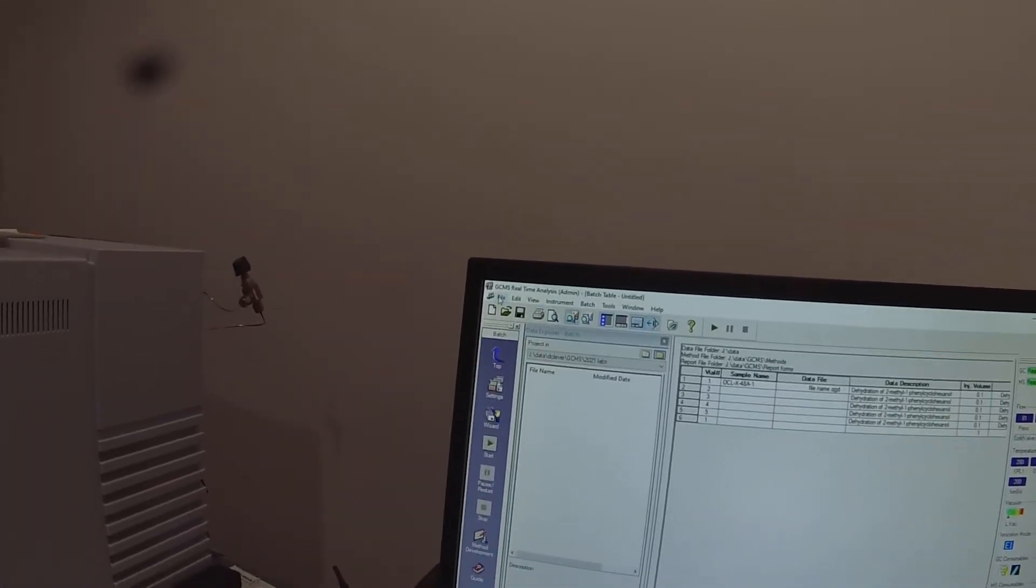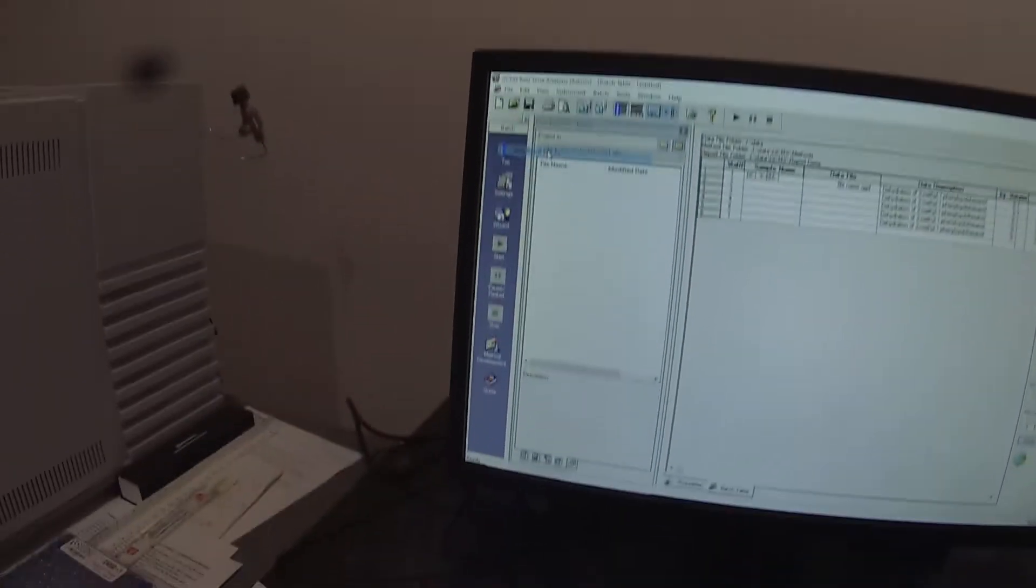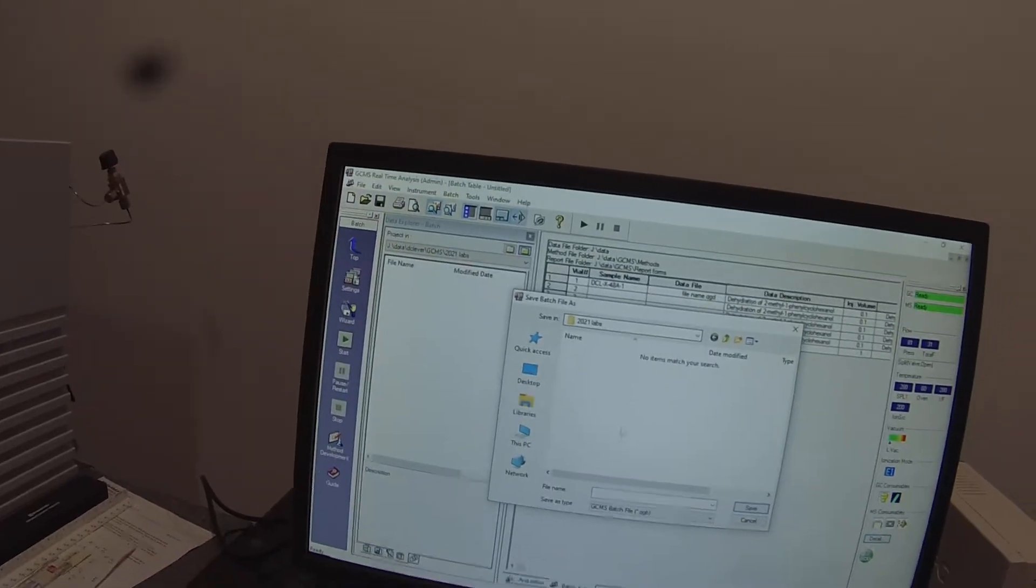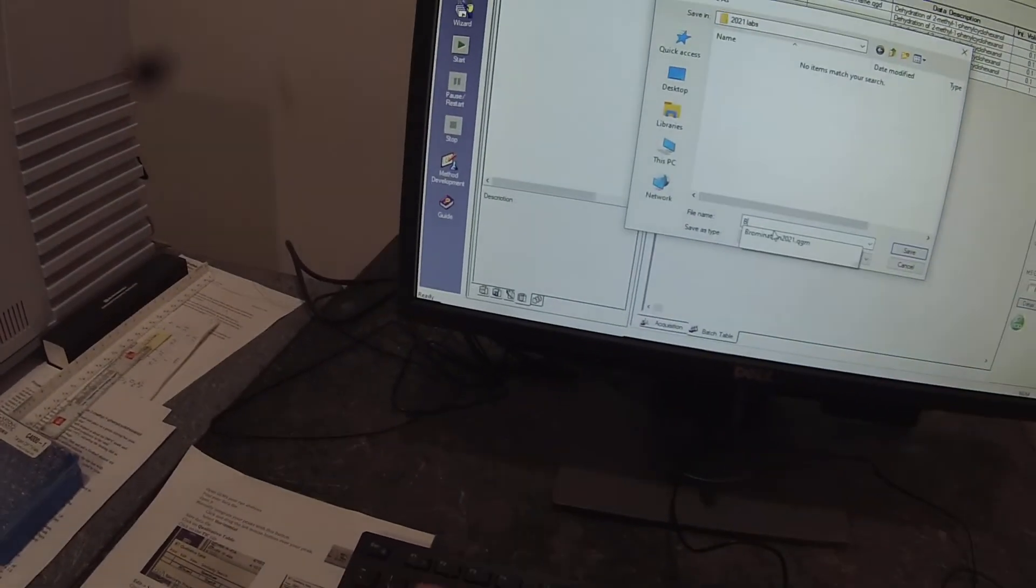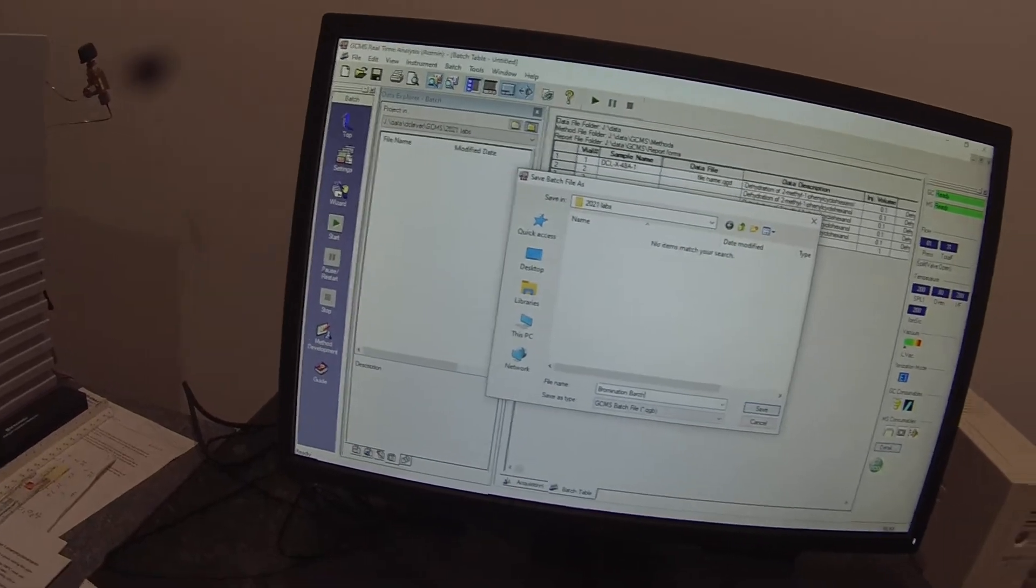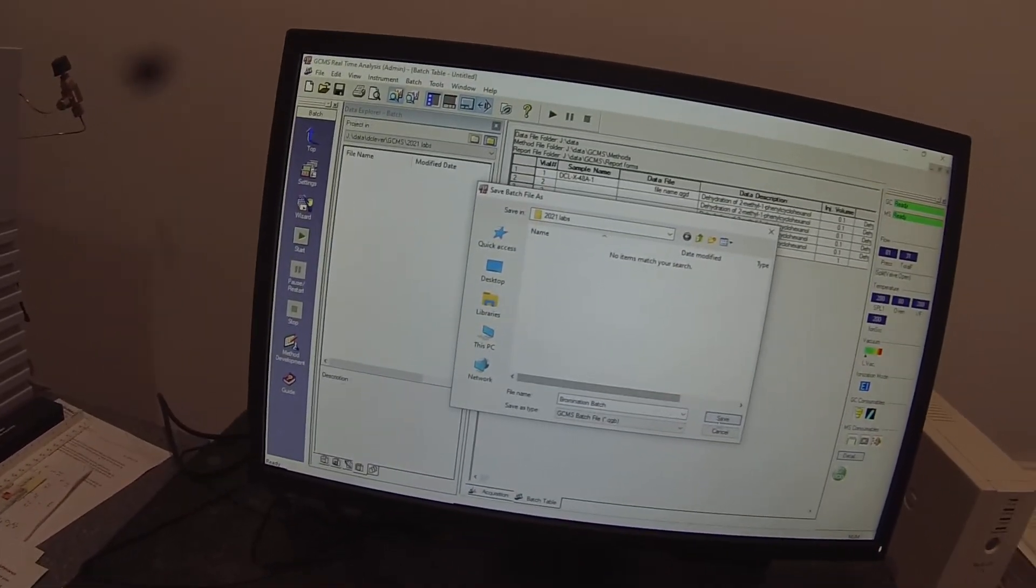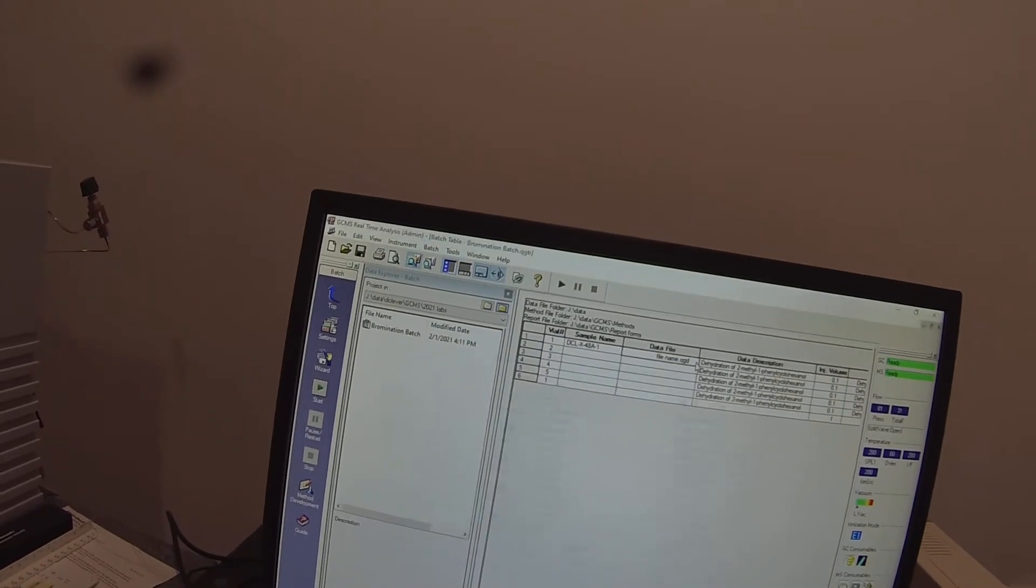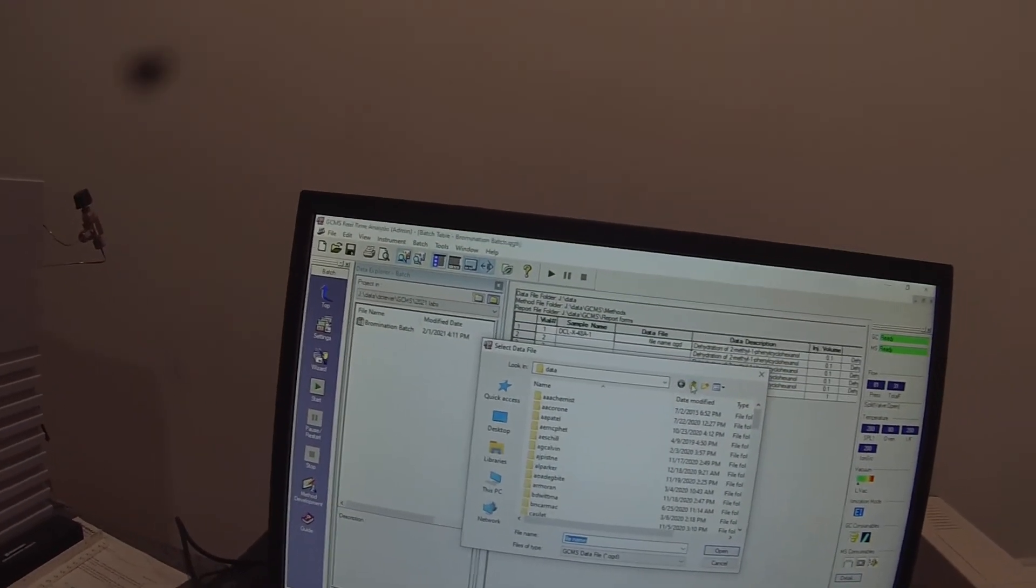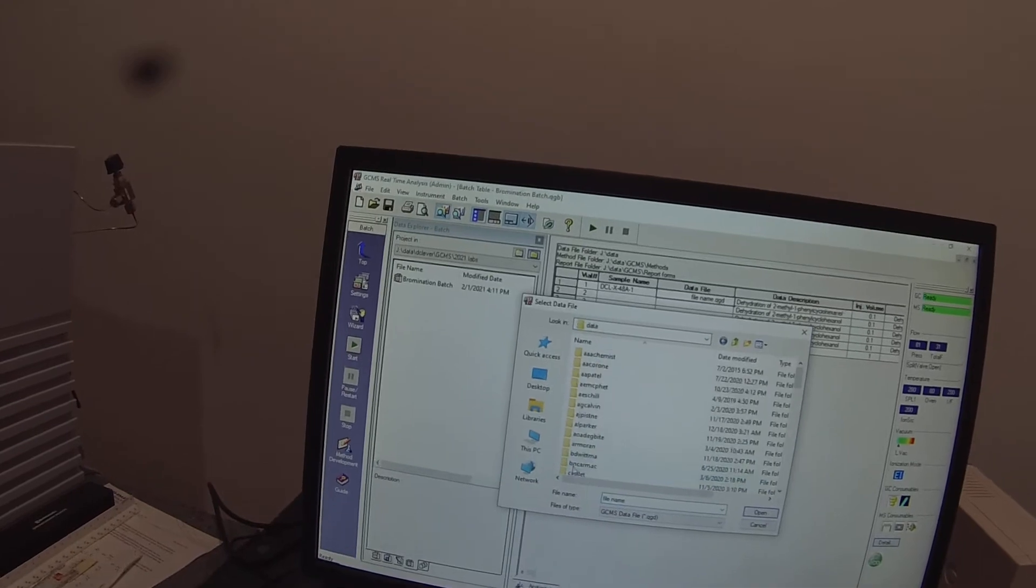I'm going to save this batch file before I forget. And put it in my folder and call it bromination batch.